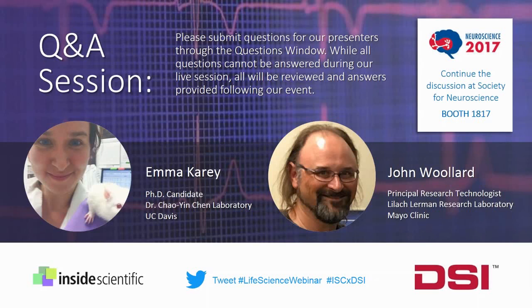Now, our control animals, we didn't see a lot of difference, and it could simply be that we do have smaller numbers. We only have 4 animals in our normal diet control group. We're hoping to add a few more animals to that group so that we can look at those particular differences later on. Okay, very good.